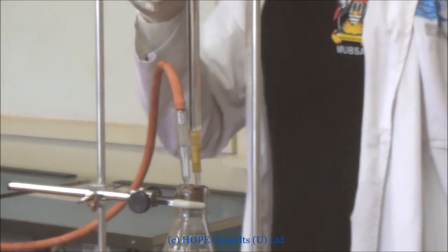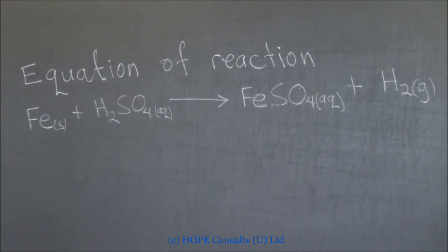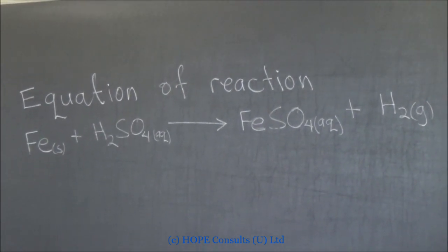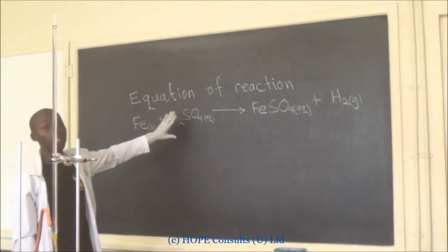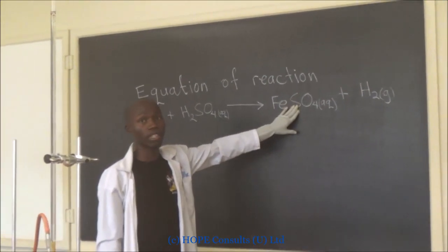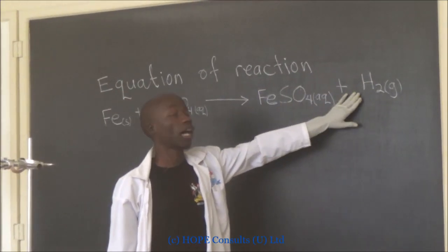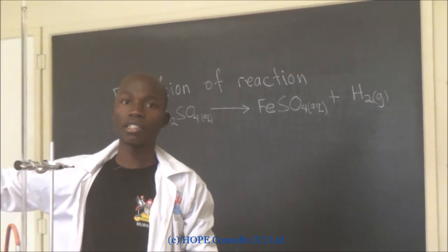The equation of reaction will be as follows. When I add finely divided iron into the sulfuric acid, I will generate these products: iron sulfate and hydrogen gas, which I am going to collect into this balloon.